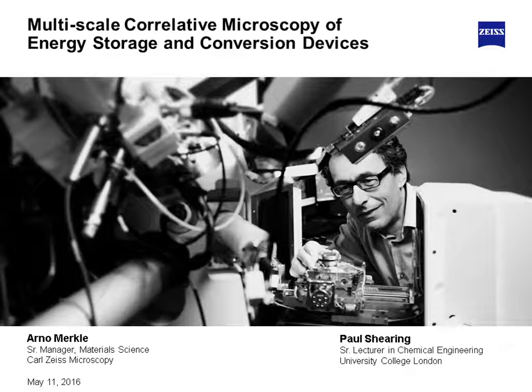Where you save time, as anybody familiar with FIB-SEM tomography knows, is that once you've started the FIB-SEM tomography, it's an investment, so you want to be sure where it is. A quick investment in that alignment step, where the user guides the process at the beginning, is necessary, but if you can then target multiple regions, the time savings or productivity savings at the end are quite beneficial. So I hope that answers the question.